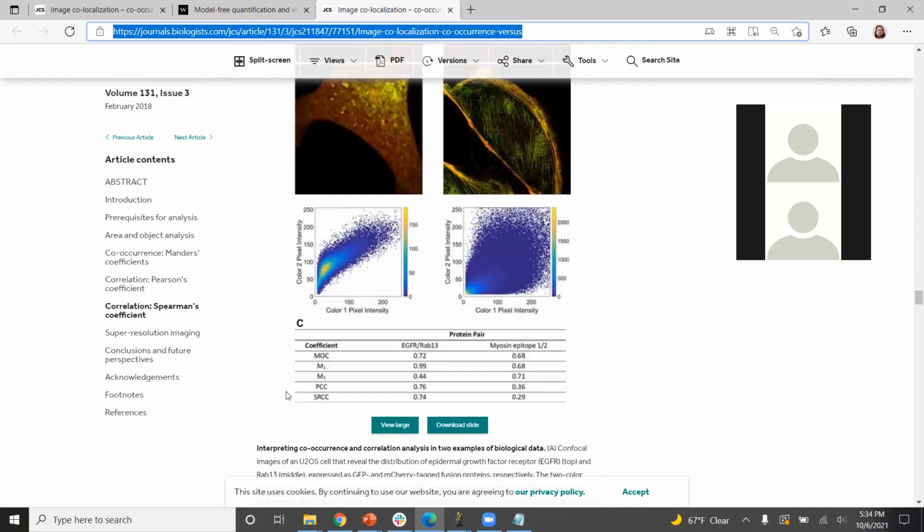Thank you. Yeah. And one more thing I want to add is, you might want to try this too. When Stoyan compared a cell with the mitochondria versus the entire image with the mitochondria, you can go one more step ahead and draw an ROI only on the mitochondria, right? Because the goal is to know whether the mitochondria in the other channel localizes with the mitochondria in the first channel.